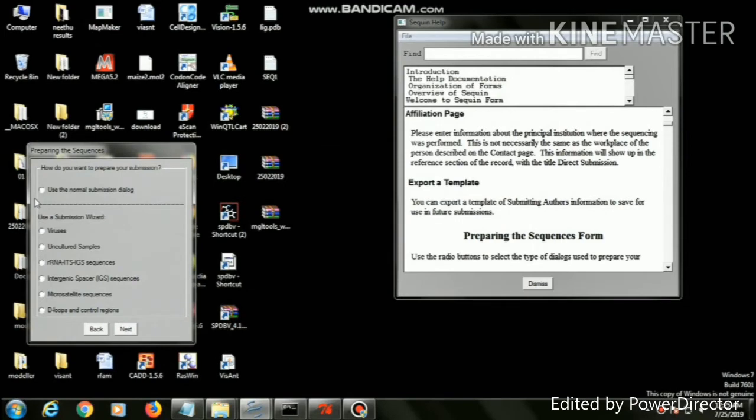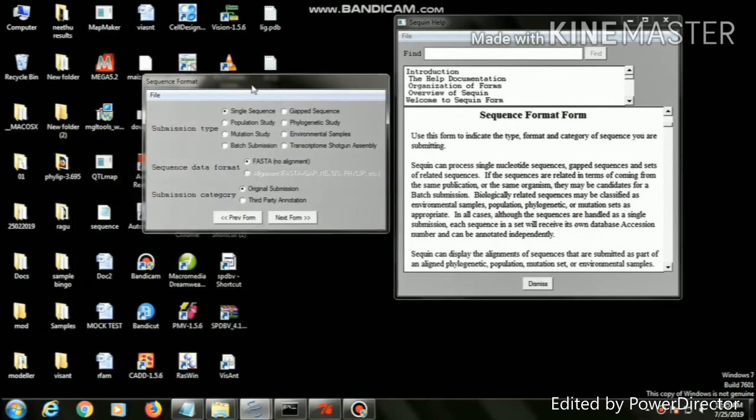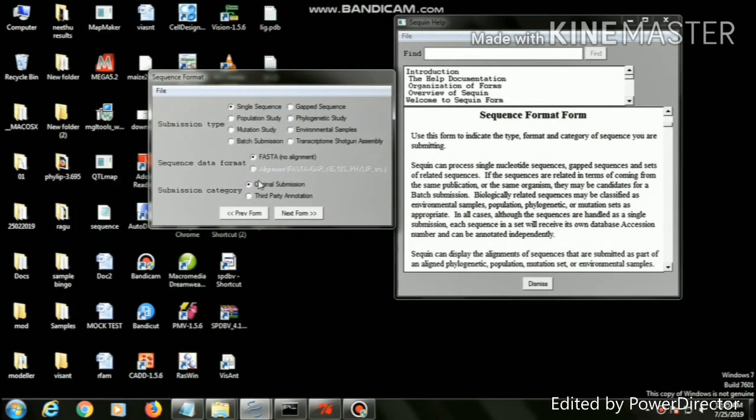How do you want to prepare your submission? Click use normal submission dialog, then click next page.